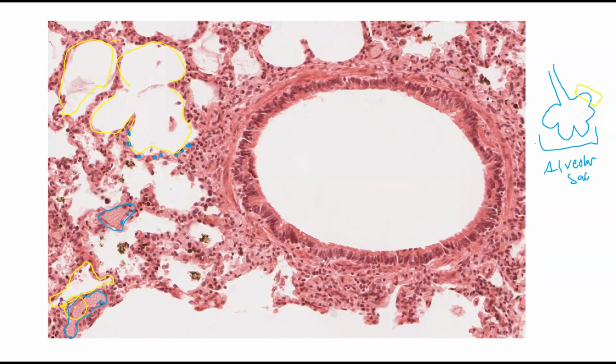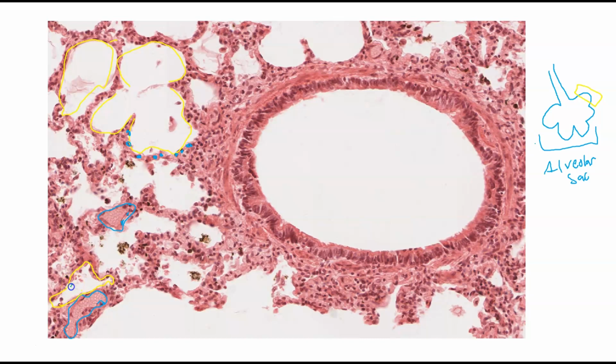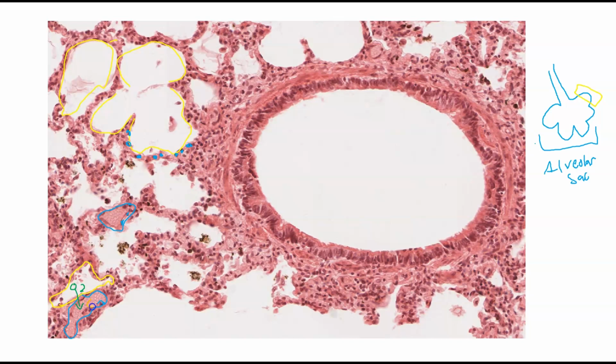And so we are going to be getting exchange of, obviously, green oxygen into the blood. And as we all know, carbon dioxide, we all know that's orange, right? So CO2 will be leaving to come out with our breath out. So there you go. There are the individual cells and structures of the histology of the respiratory system.